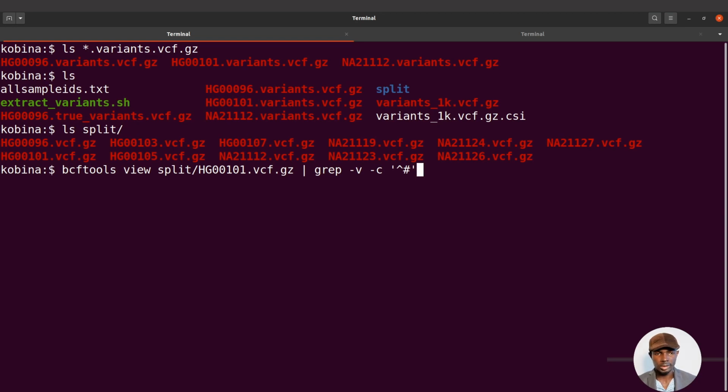All right, so there it is. Let's count the sample here. We should get 9-something because that's what we got for the others.